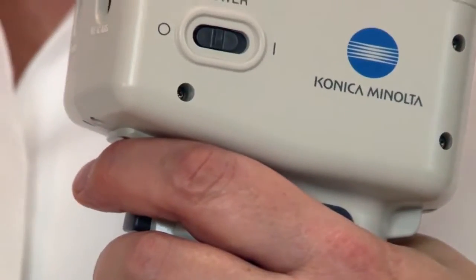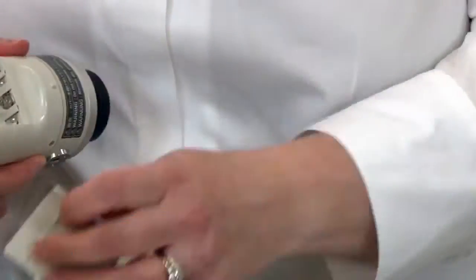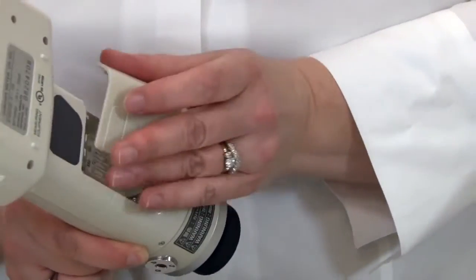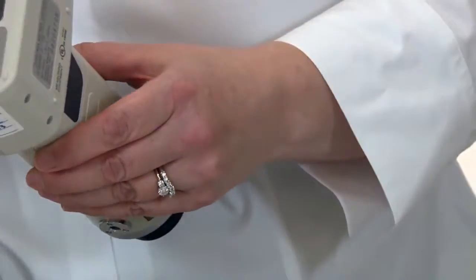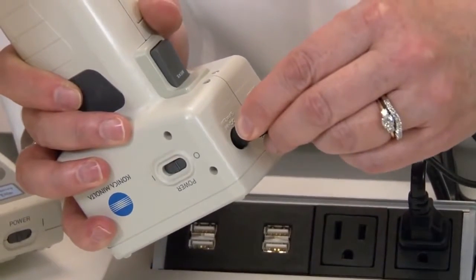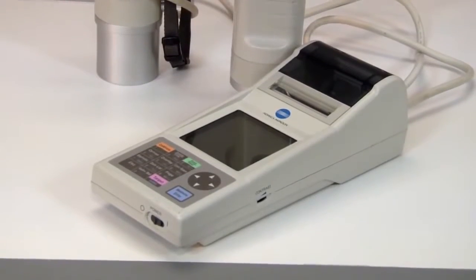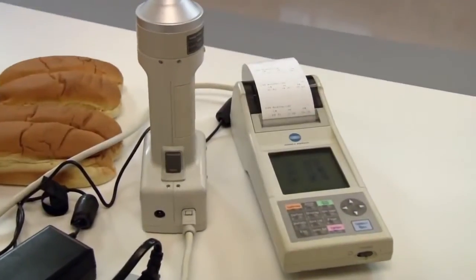Imagine holding sophisticated color measurement capabilities in just one hand. The popular handheld series is easy to use and operate with this compact, lightweight design. Powered by battery or AC adapter, the colorimeter series includes an optional compact data processor, LCD display screen, and printer which enables users to print results.